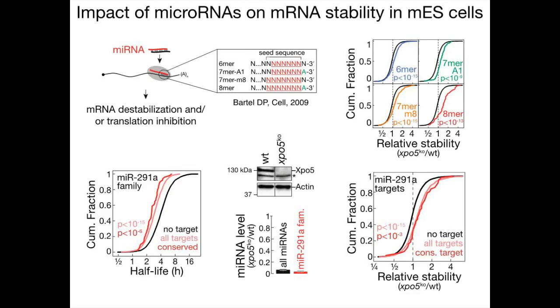Now, in summary, these data provide quantitative evidence for microRNA-mediated mRNA decay in mouse embryonic stem cells and validate SLAM-seq as a sensitive tool to study the molecular basis underlying the fine-tuning of mRNA expression levels by microRNAs, and therefore also more generally the mechanisms underlying post-transcriptional gene regulation.